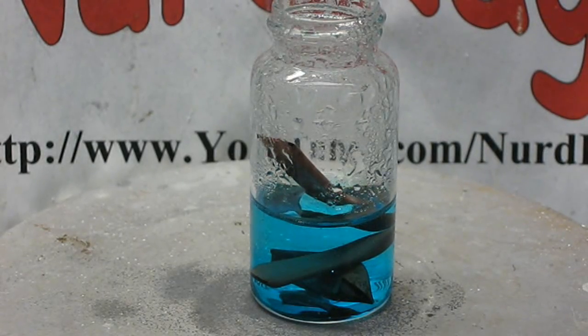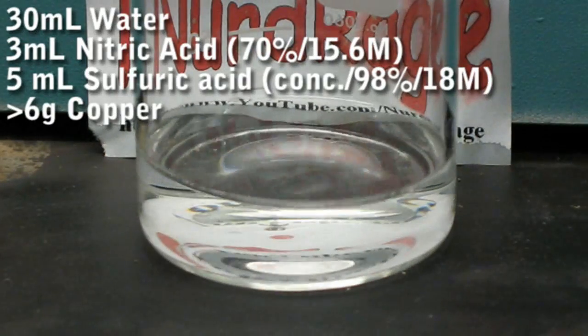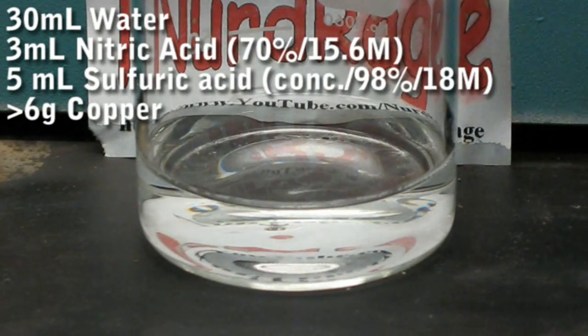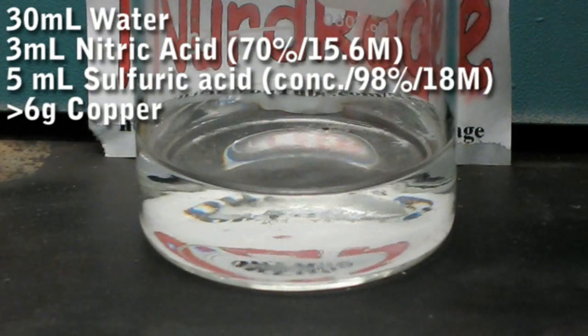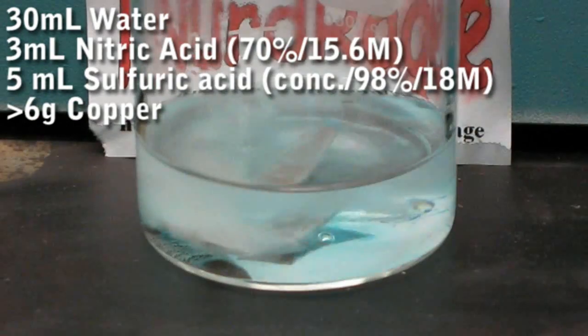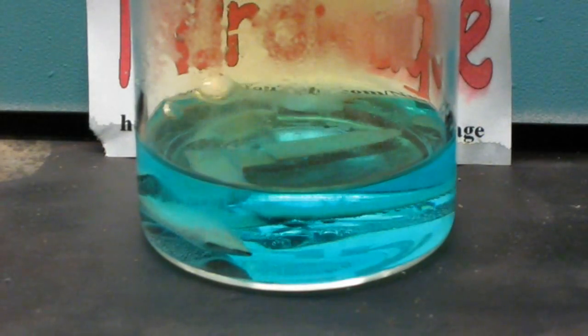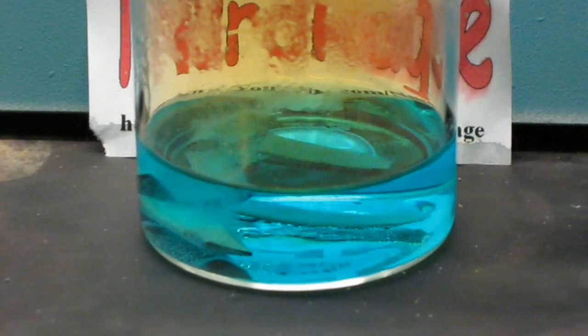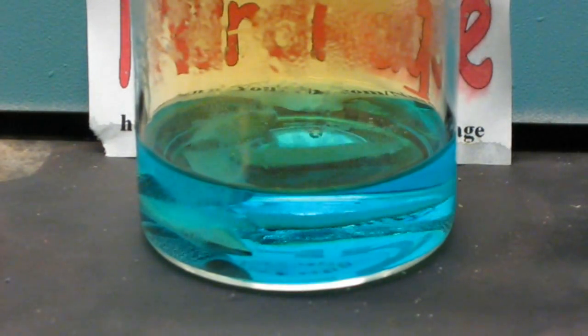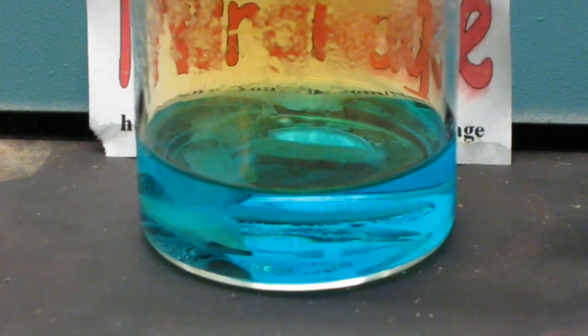A better method is to use nitric acid as your oxidant. First get 30 mL of water and add 3 mL of nitric acid along with 5 mL of sulfuric acid. Then add in 6 grams or so of copper metal. The reaction will produce both copper sulfate and nitrogen dioxide gas. Because the gas is toxic this must be performed outside or in a fume hood. When it stops fizzing it's done.